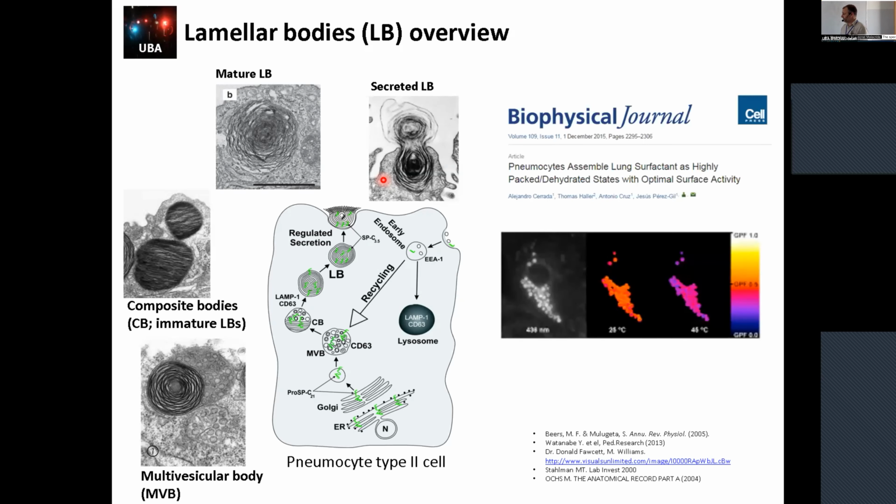And at that point, when I was doing my PhD thesis, it wasn't that clear what the organization of this lamellar body inside the cell was in terms of the lipid organization. When we were doing the experiment, this other group from Spain showed, using the GP, that these lamellar bodies inside the cell are on a shell organization, which means that they are really, really packed.